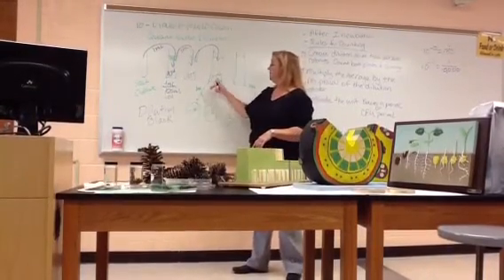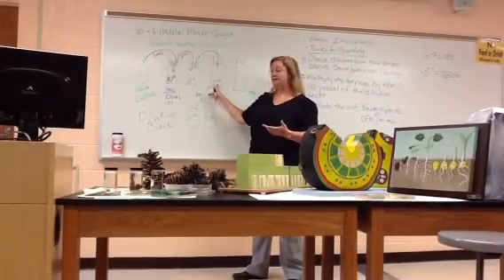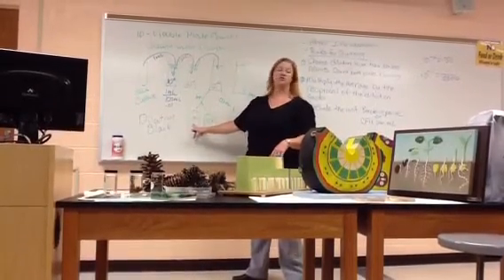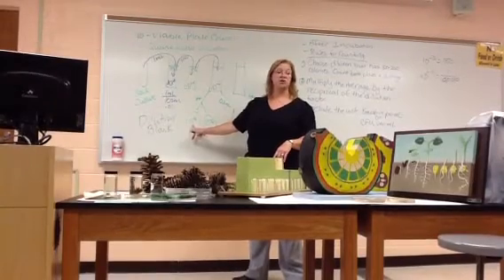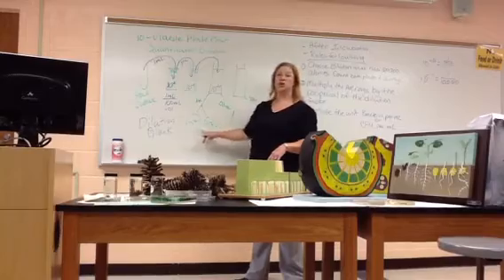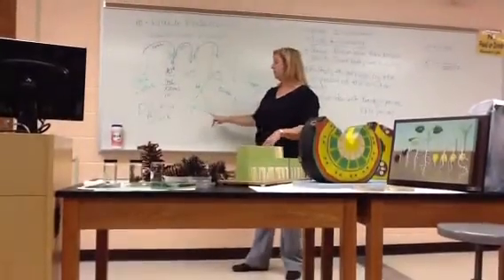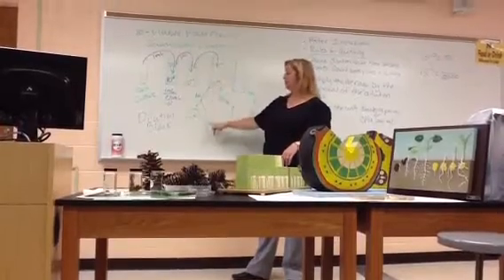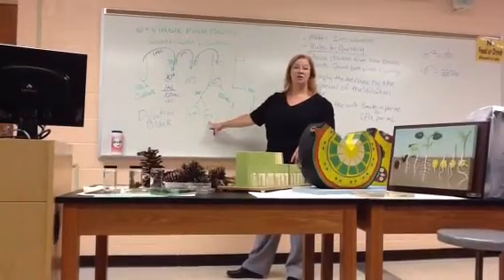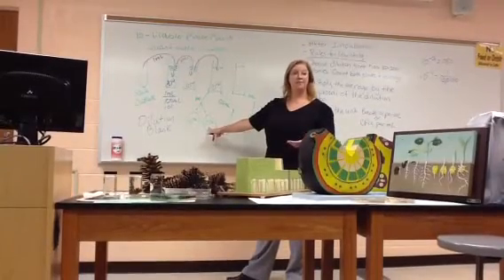So we're going to take a ml of liquid from this dilution, the water that we've just diluted with bacteria, and put it onto a nutrient agar plate. It's just plain old nutrient agar. And we're going to make duplicates. We're going to do it twice. We'll put a ml of liquid onto one nutrient agar plate, put another ml of liquid from this container onto a second nutrient agar plate. We always make duplicates in case something goes wrong with one, we've got a backup.